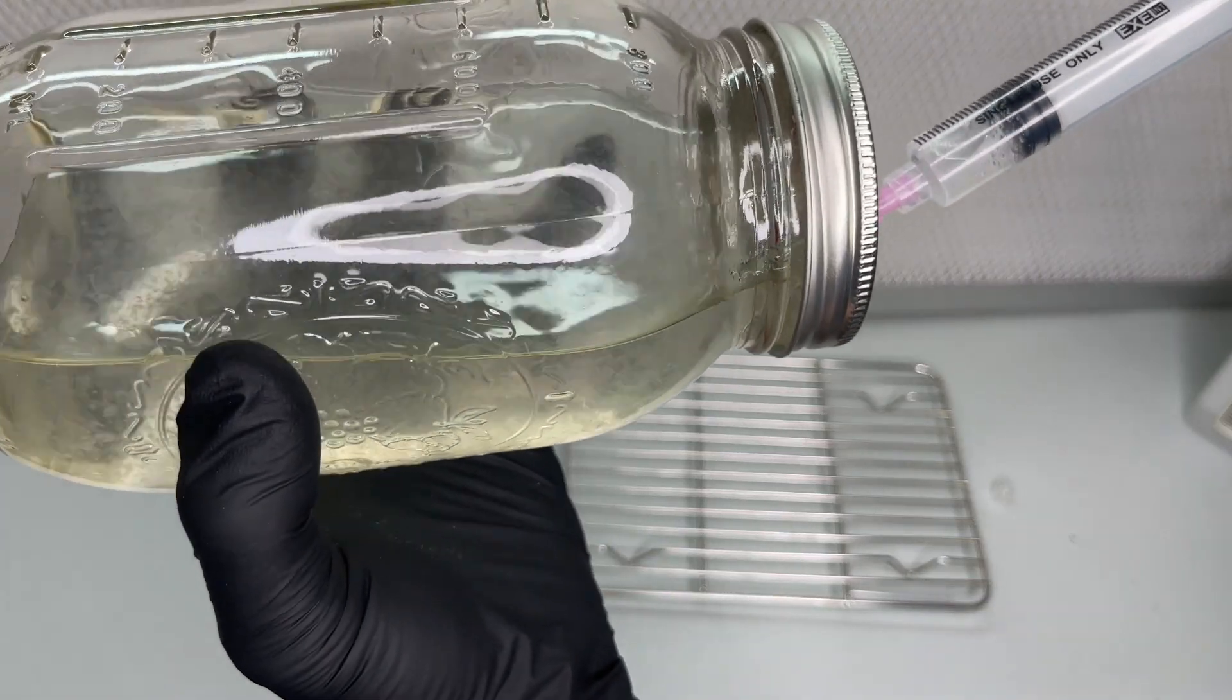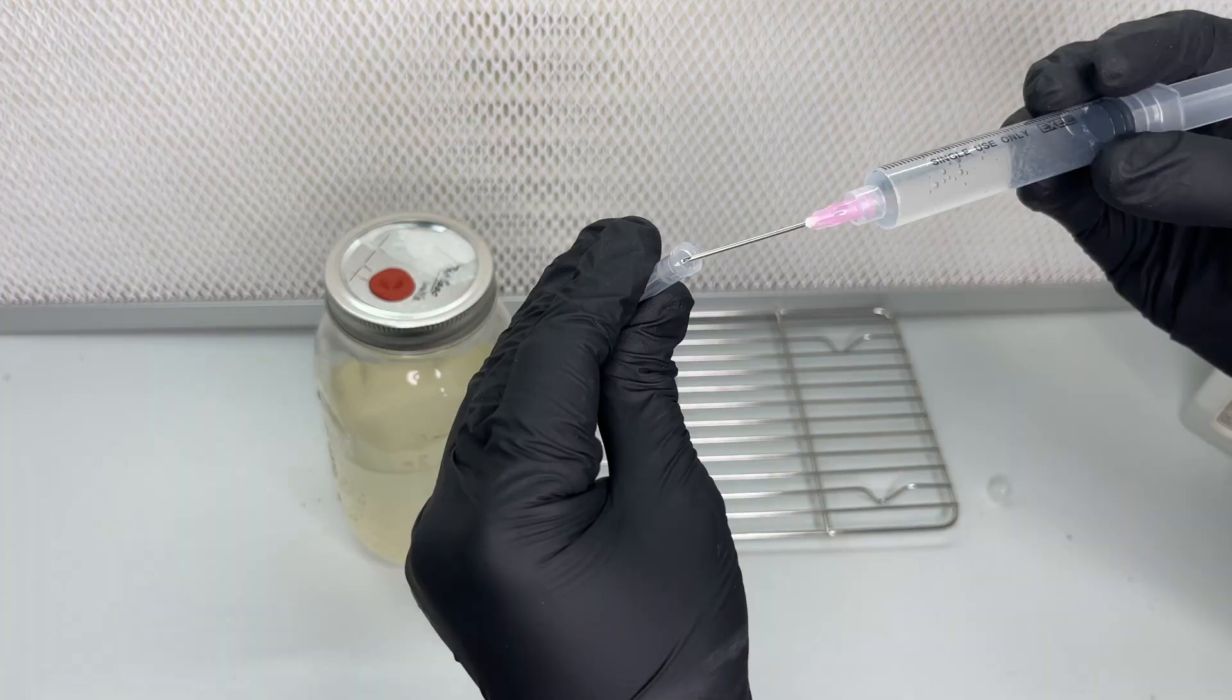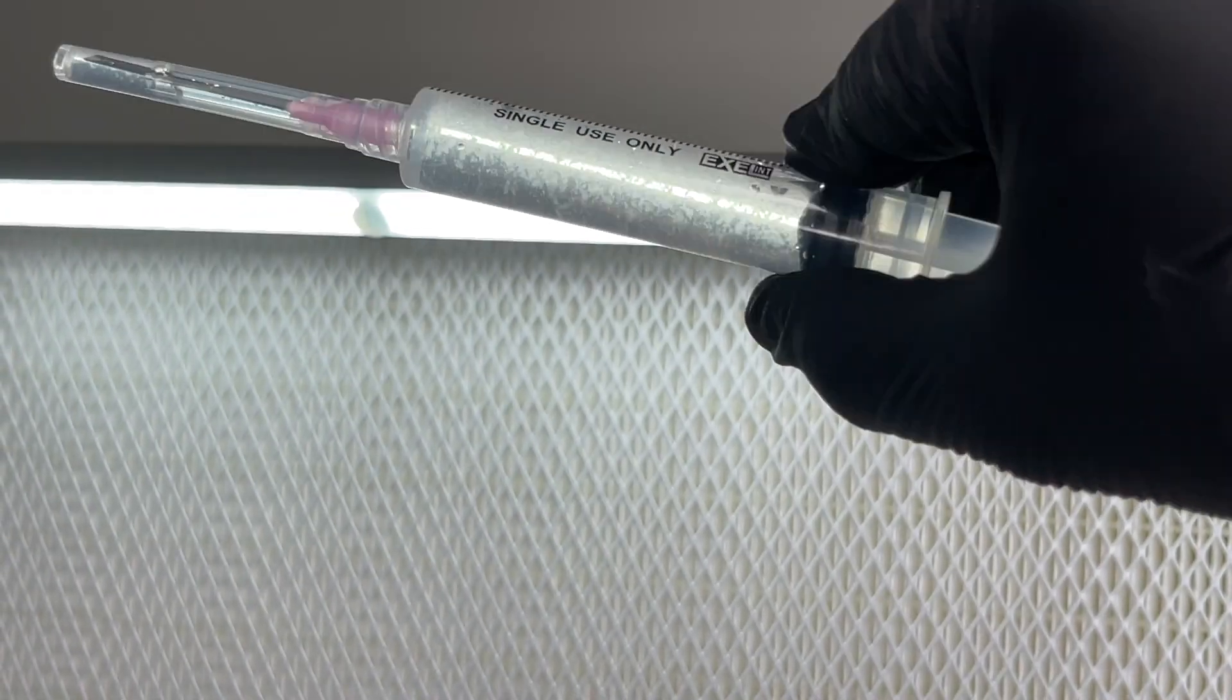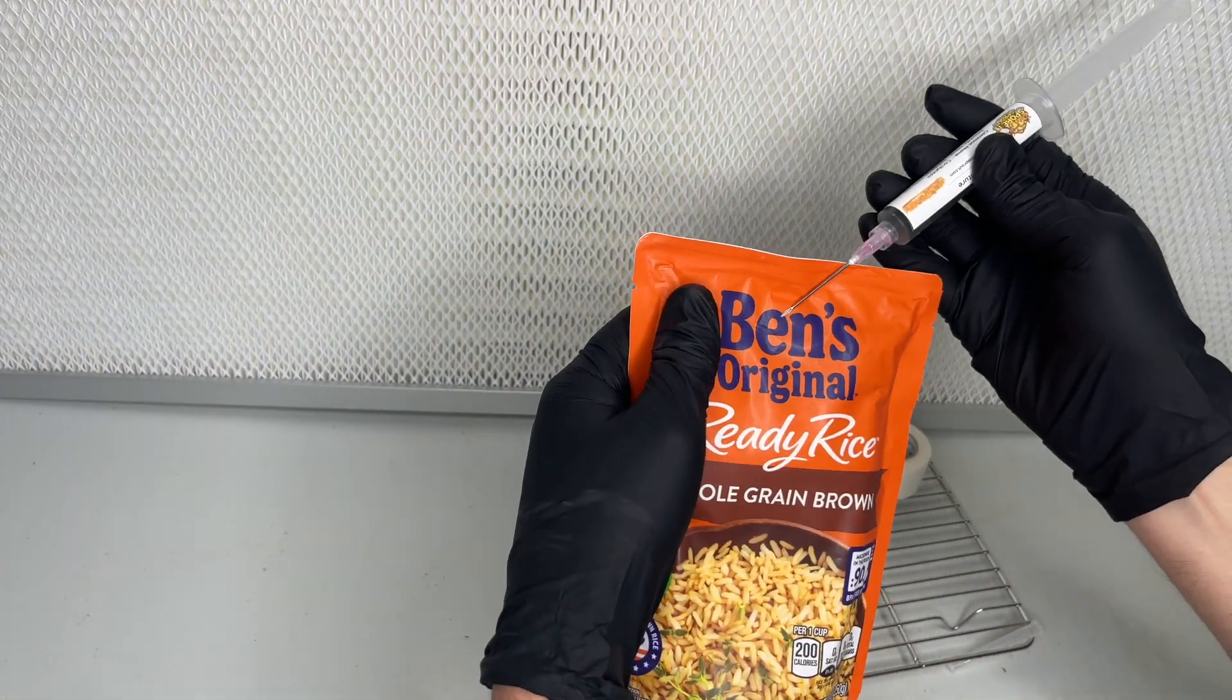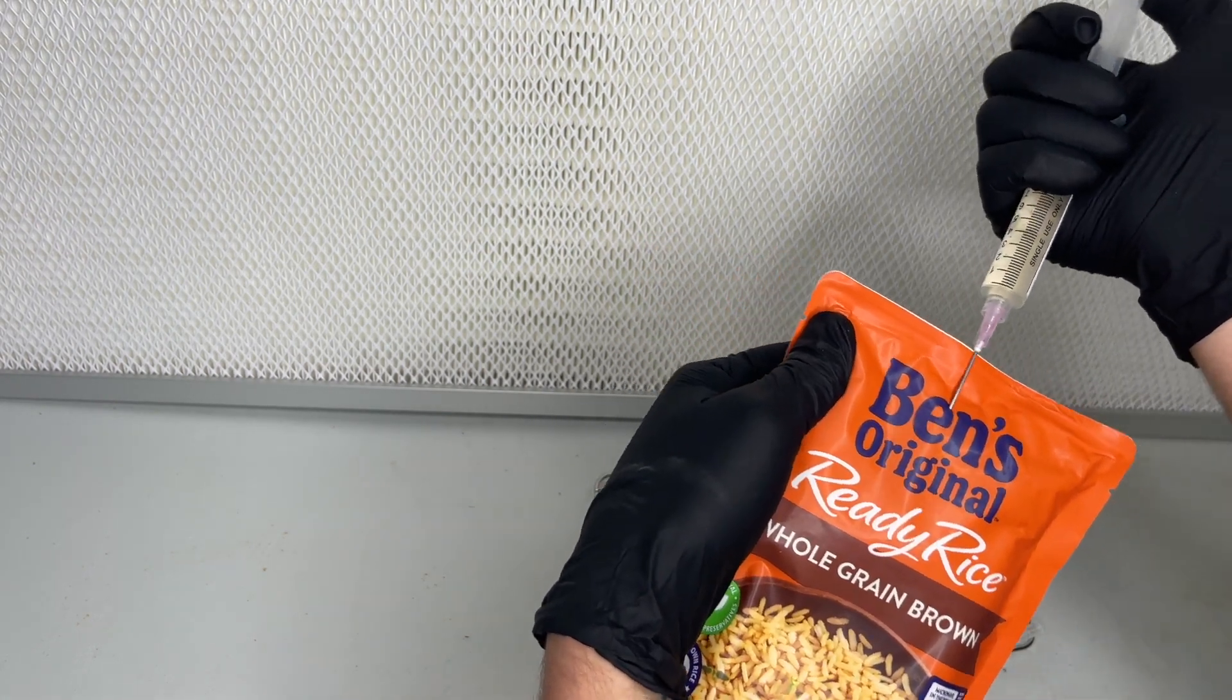Here I am using a sterile syringe to extract some liquid culture to grow some cordyceps. For most species I use 2 milliliters but for cordyceps I use 10 milliliters.